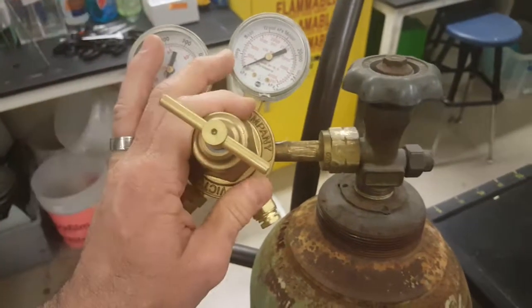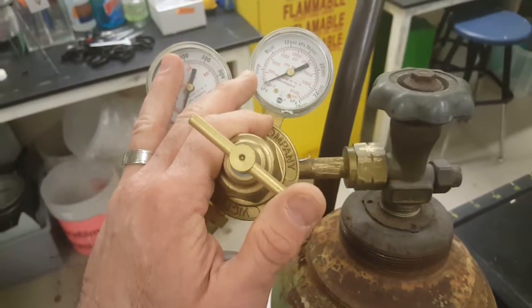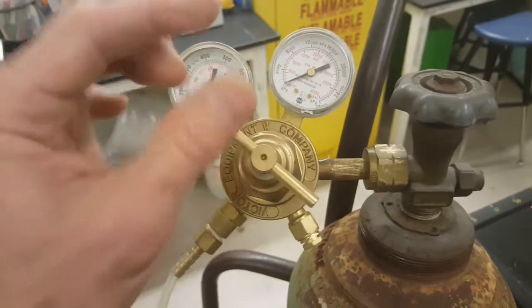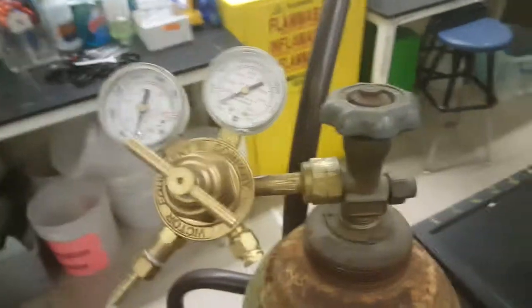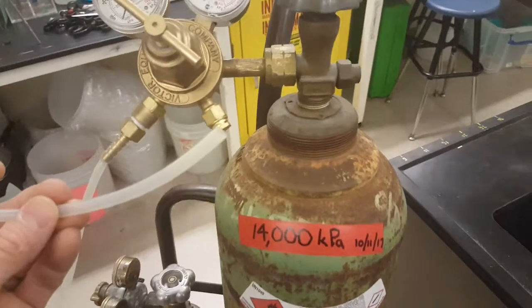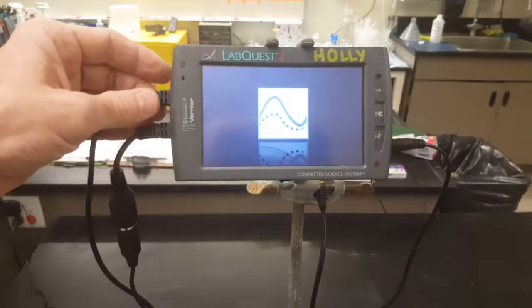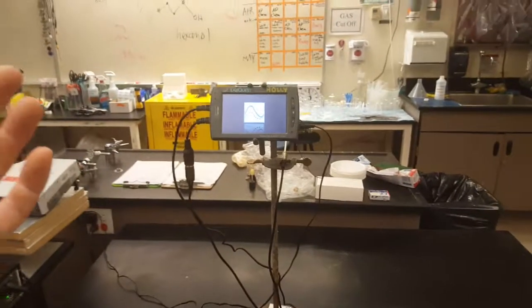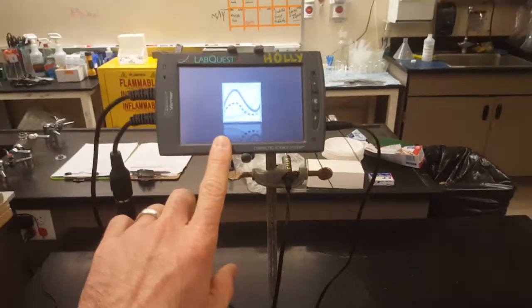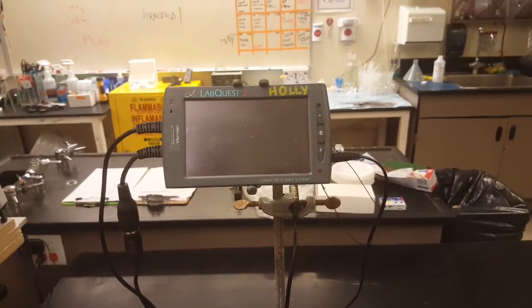Your teacher will hang out by the gases today to make sure that you don't waste any of the gases. Also, be careful to pull the glass tube for your stopper away from the hose before your bag pops. It's not really a big deal, but you'll have to redo that part. All right, I think that's pretty much everything you need to know, except for where you find the pressure and the temperature in the room. Our LabQuest here in the middle of the room will tell you the pressure and the temperature. You might have to do some conversions, but everything here is what you need. Good luck today. Have fun.